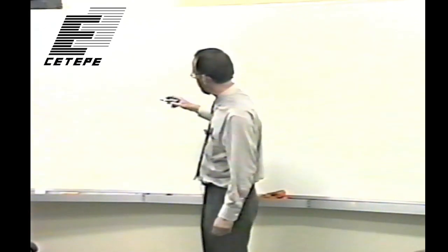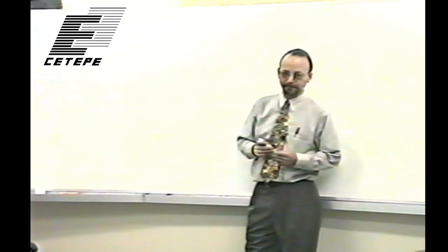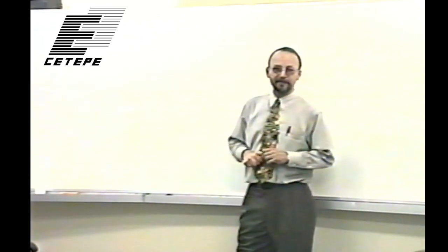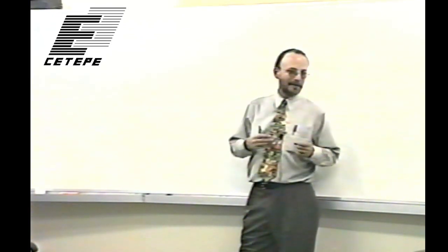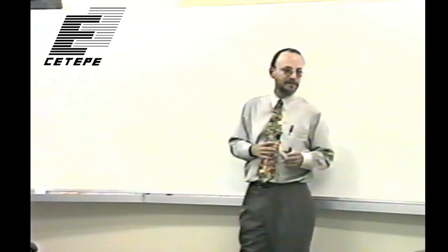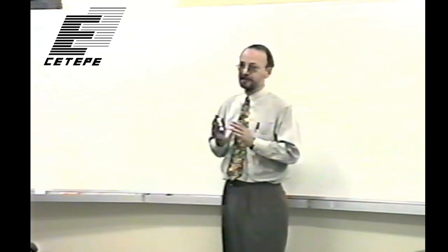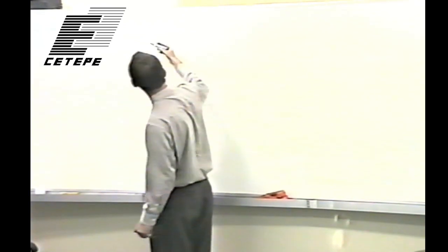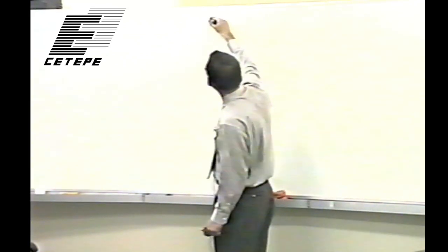So getting back to a little discussion we had yesterday about the radioisotope X-ray sources, or gamma ray sources, one of the reasons that they're so nice, and one of the reasons that we try to shape the X-ray spectrum of laboratory sources to make them quasi-monochromatic, or at least enhance the radiation emission in certain energy bands, is because if you think about it, let's say that these were the K edges for iodine.